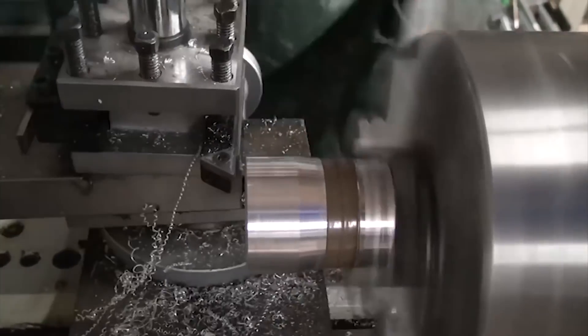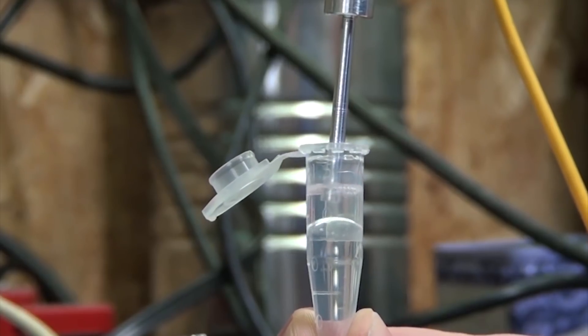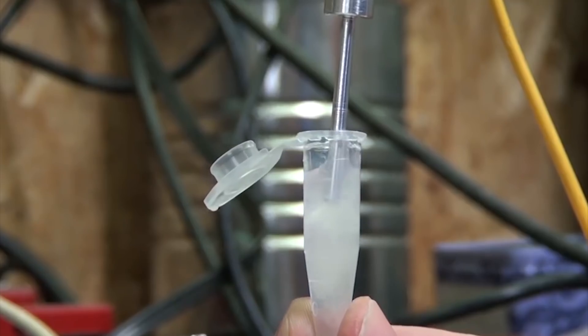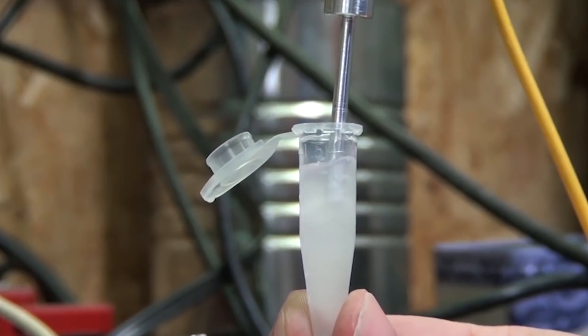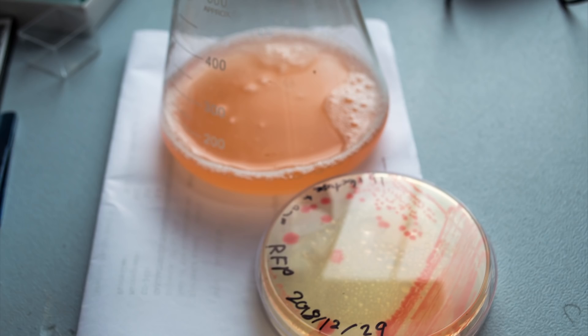A few weeks ago we talked about my first real machining project on the new metal lathe. In that video I built an ultrasonic homogenizer which is essentially a small spike that vibrates very fast and is used to break open cells and make emulsions. Since then we actually got a chance to try it out in the lab and used it to extract some fluorescent proteins from E. coli.